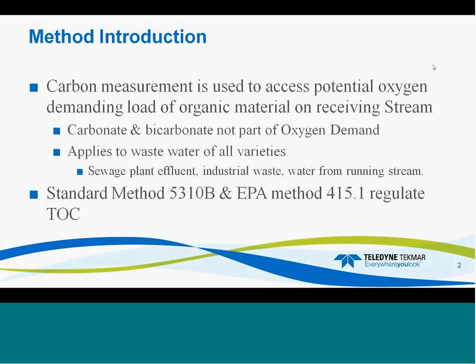The reason that we all do TOC is to analyze for oxygen, which is to assess the potential oxygen-demanding load of organic carbon, so fish and living organisms that are in the water. If there's a pollution, it takes up the oxygen demand, and obviously it's hard on the living creatures of the water world.